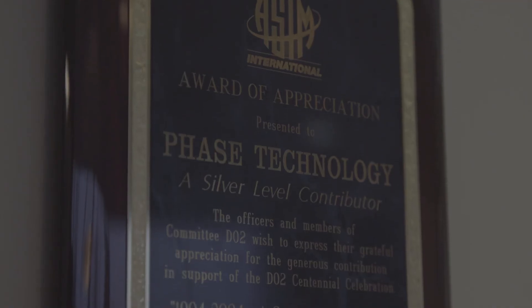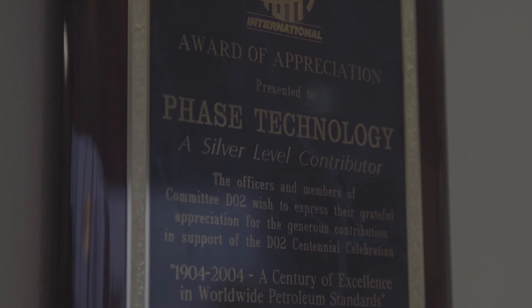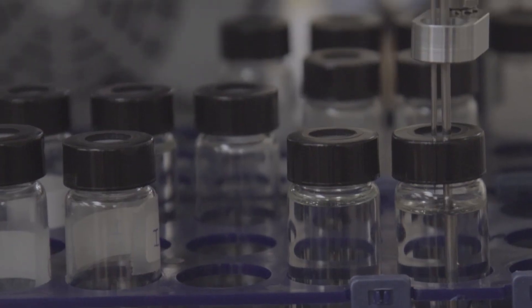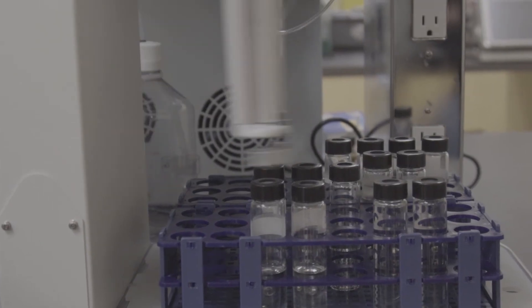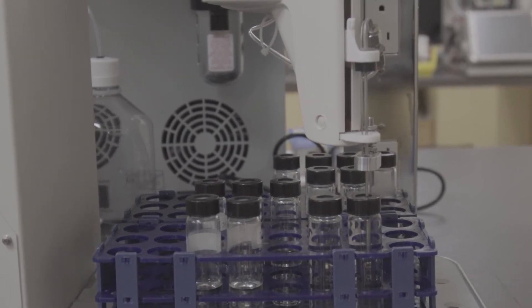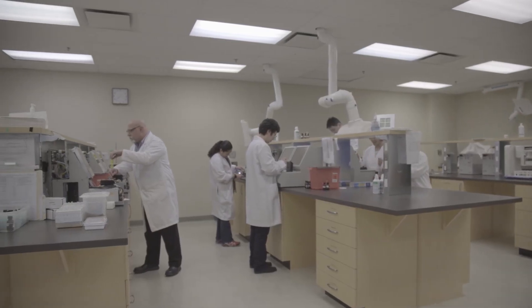Phase Technology is a leader in its market. Our test methods are the most accepted worldwide standard in the global petroleum industry, and we consistently rank highest for repeatability, reproducibility, sensitivity, and equivalency to referee manual tests and methods.